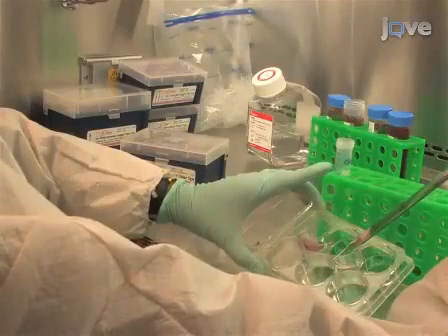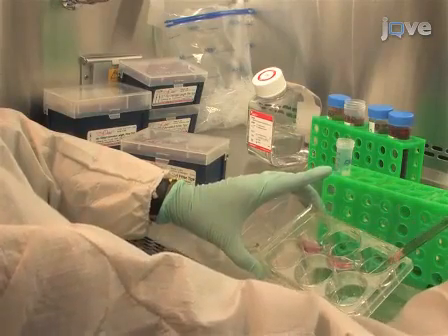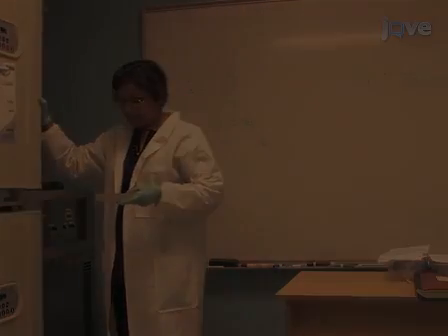Prior to adapting human-induced pluripotent stem cells to feeder-free cultures, prepare Geltrex-coated dishes. Next, passage.